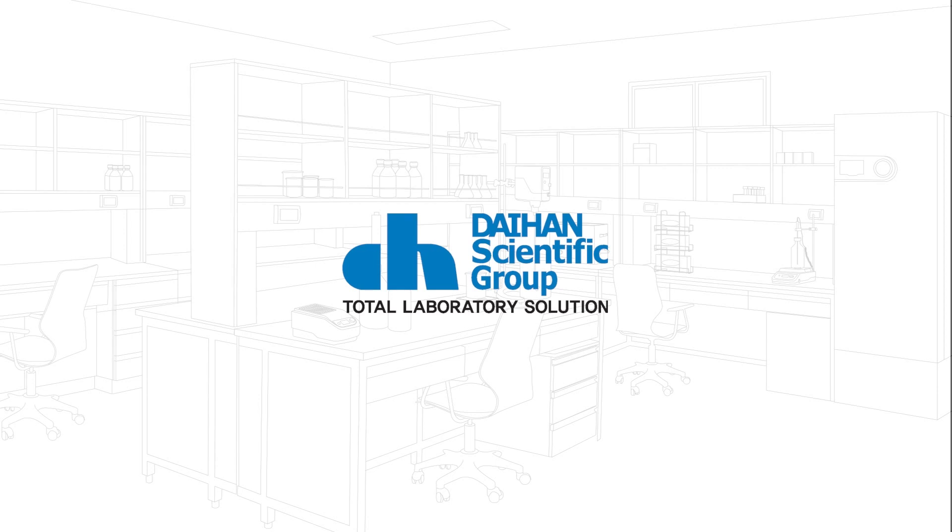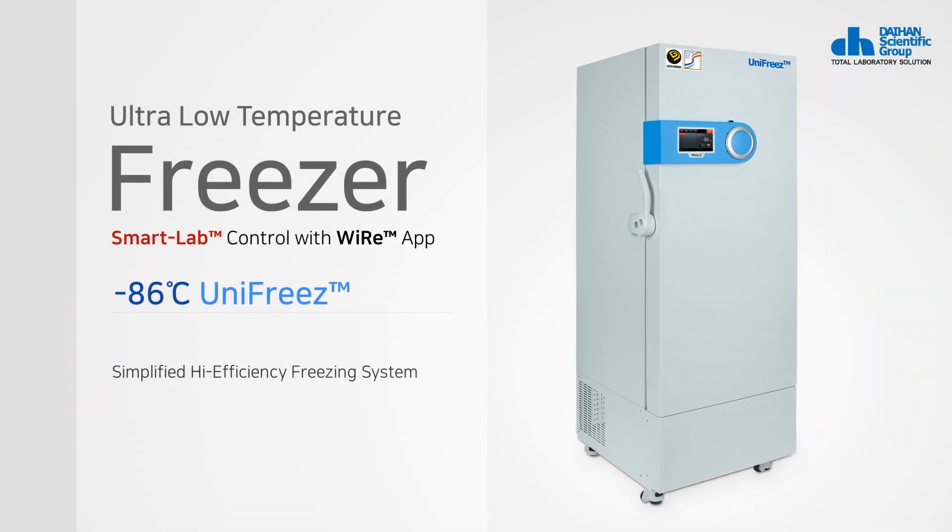Daehan Scientific is a total laboratory solution provider in Korea. Hello, we'll introduce the ULT Freezer of Daehan Scientific.